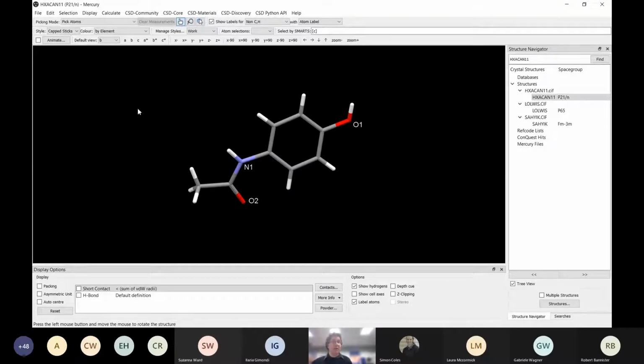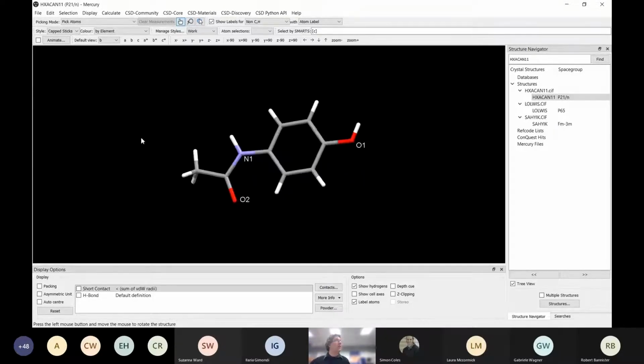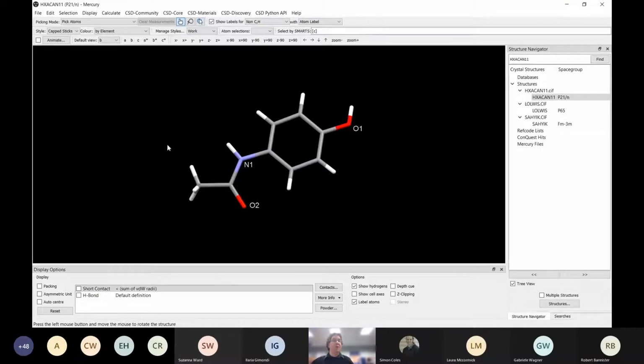Finally, just before we do anything else, as I say, I've been doing everything on this black background, which for this presentation is absolutely fine on computer screens. But if you want to present it in a report or a thesis where you're going to have to print it out, black is still horrible for printing. So we have a few options to get to the same thing.